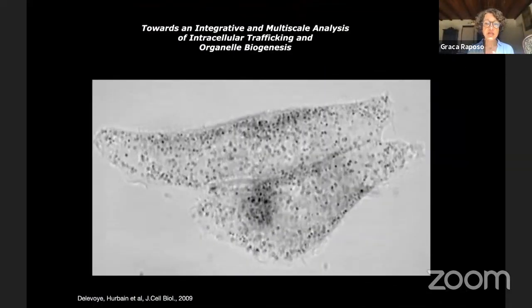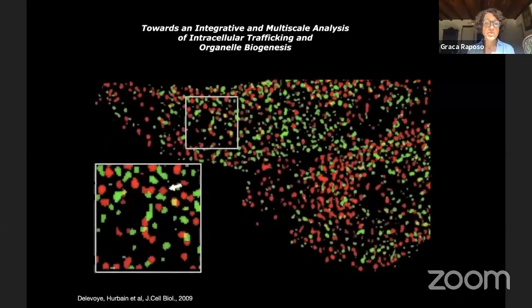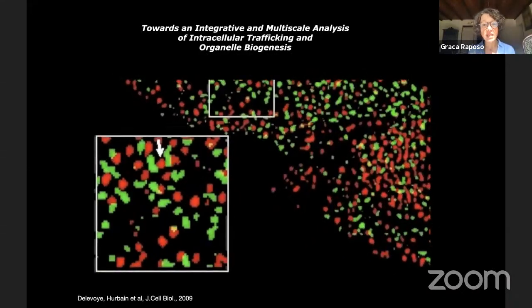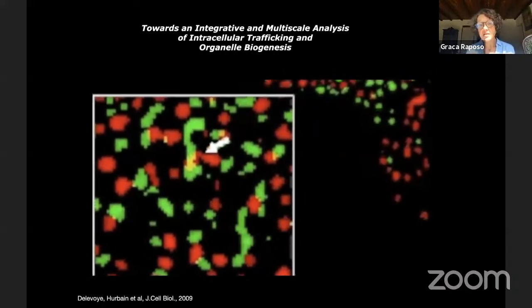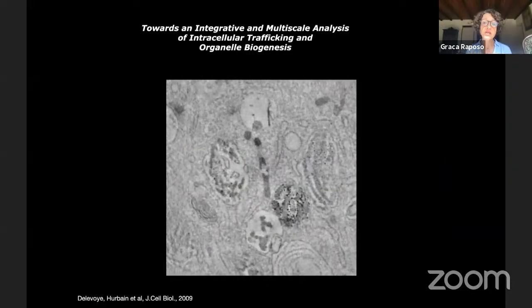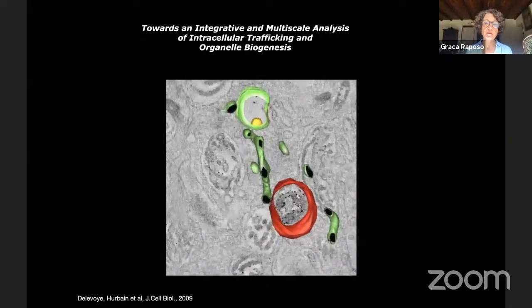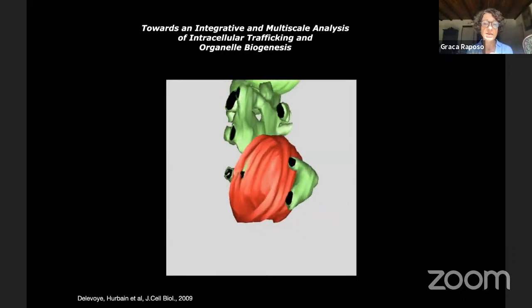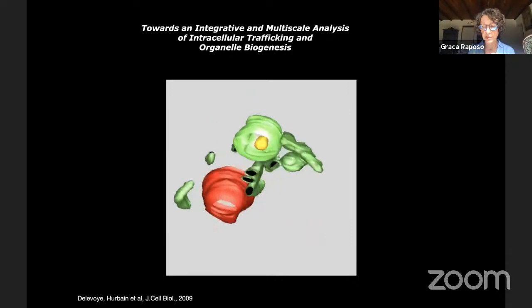So again, this is just the end, and to introduce the others, of course, as you'll see, we need all of these complementary techniques to analyze the biogenesis, to analyze intracellular localization. And so combining all these methods, and as you'll see later with Claudio and Xavier, there will be a lot of developments that are made now to really do these correlative light electron microscopy methods.